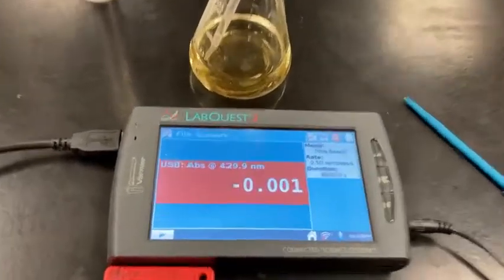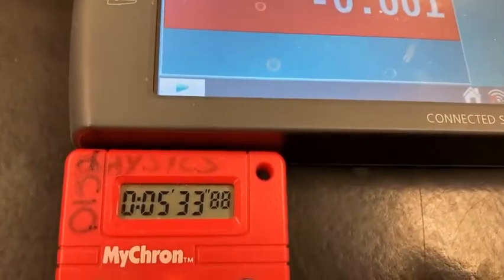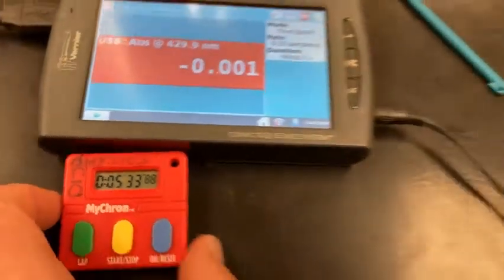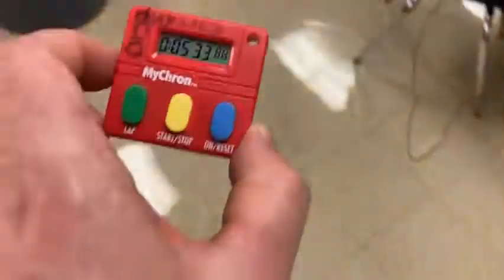Okay. We will take it at 5:33. Let's make it 5 minutes and 34 seconds. Okay. That was a long one. Trial 2, luckily, I get to do.